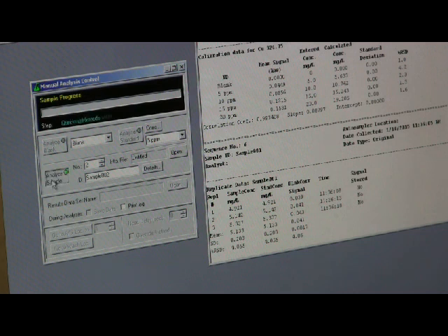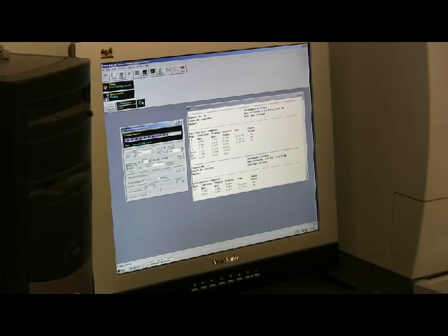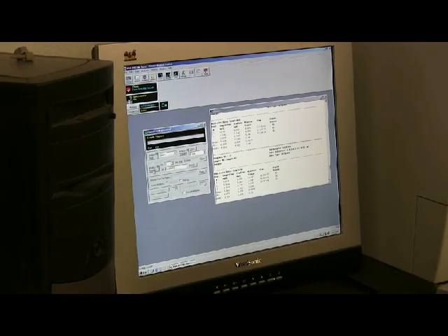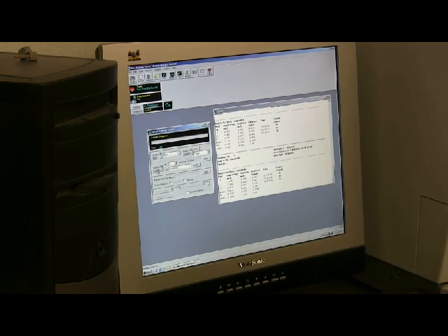My second sample is animal. I wouldn't even use the concentration given by them. As I said, I calculated it again. It's pretty close, but as I said, it works for me. Yeah, better. So yeah, that's it, done.